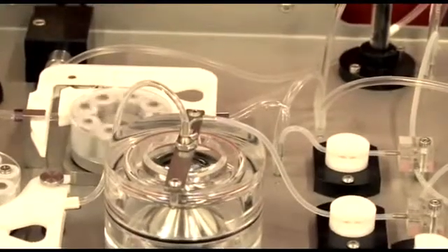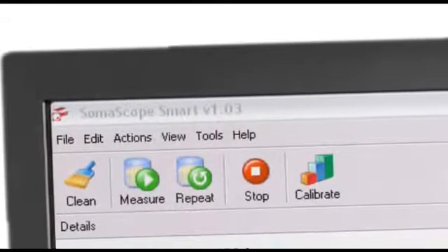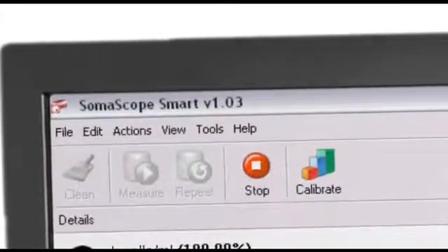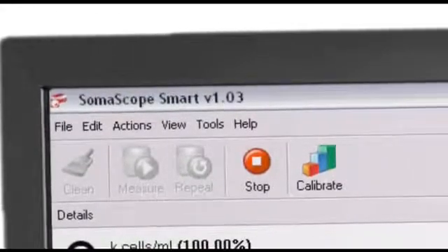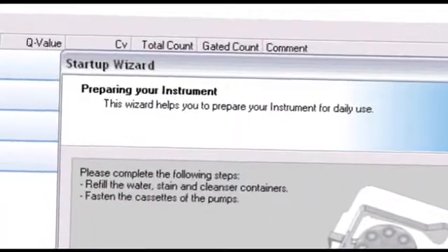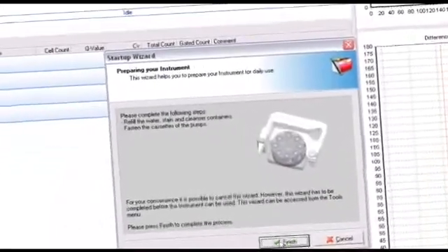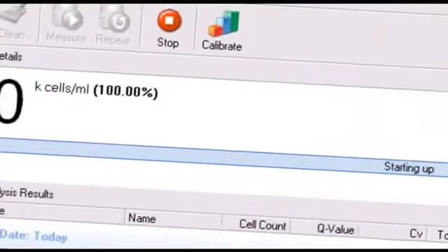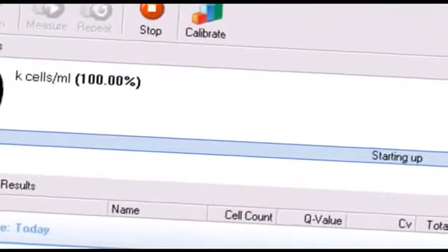The SomaScope Smart software is known for its user friendliness. When starting up, the only thing the user has to do is log in. The Startup Wizard will appear automatically. The Startup Wizard guides the user through a few basic steps: refilling the bottles, adjusting the cassettes and starting the cleaning process.